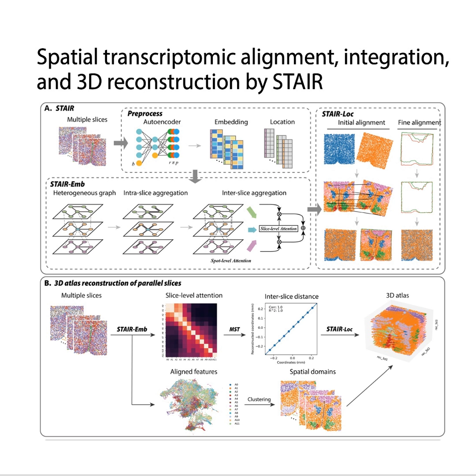And we also noted the scalability issue. We did. To accurately calculate those global slice-to-slice relationships, those slice-level attention scores, you currently need to retrain the model jointly with the existing atlas every time you add a new slice. And that can get computationally expensive for truly massive data sets.